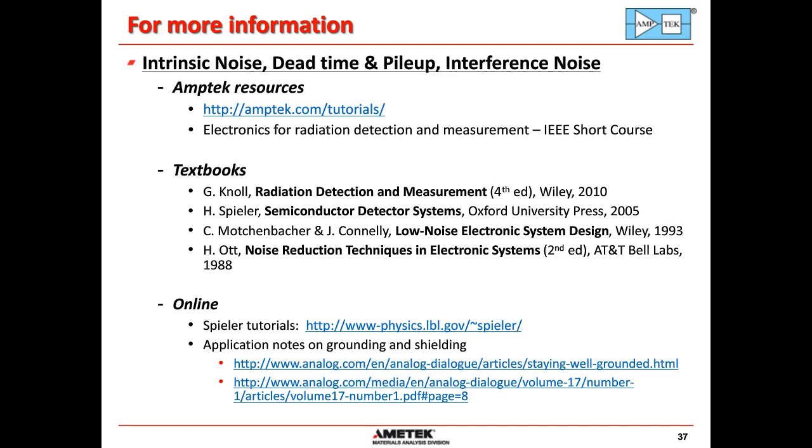In addition, there's a feedback capacitor, and those capacitances always have some temperature coefficient, and those really dominate. You also will get some temperature drifts in amplifiers and such. Those are pretty small, but the variation of gain or signal with detector temperature is pretty significant, which is why stabilizing the detector temperature is fairly critical for stabilizing your system.